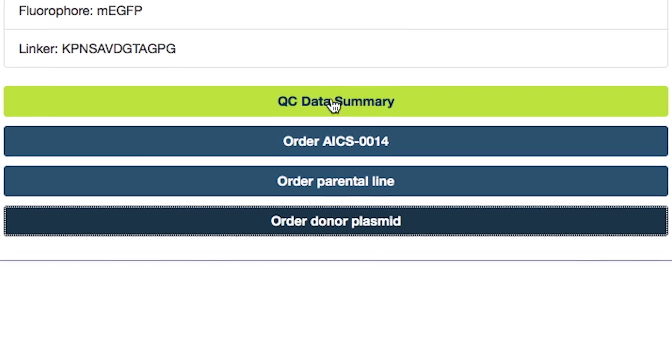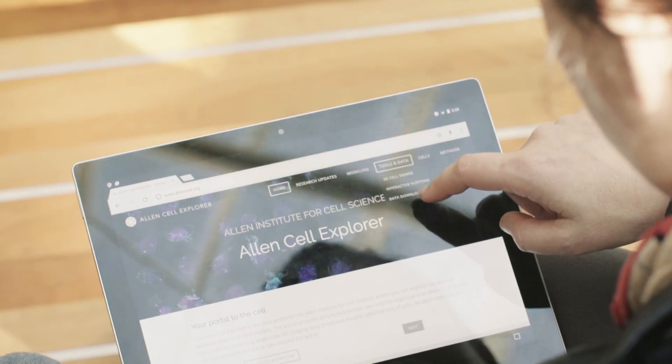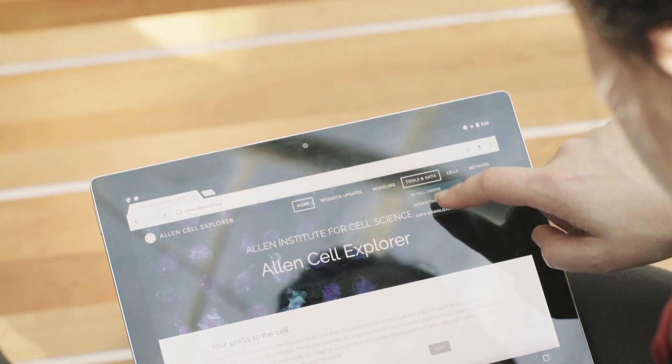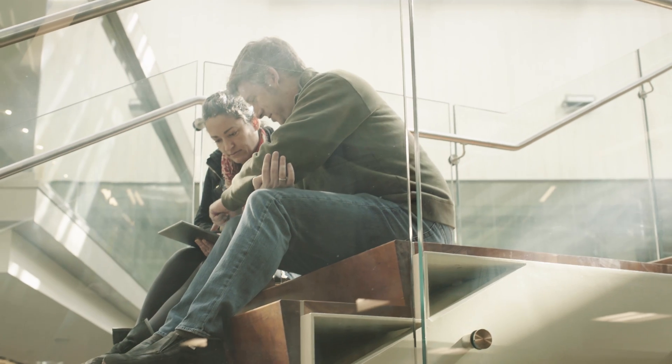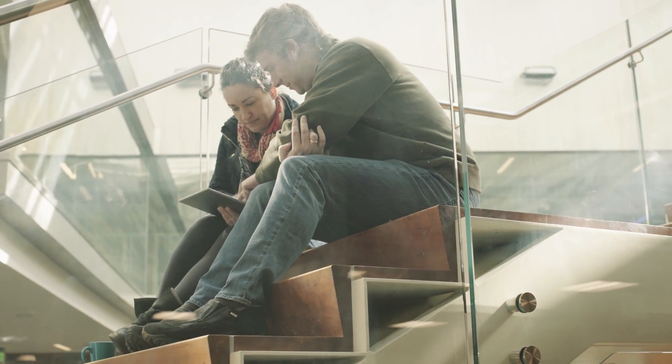The Allen Cell Explorer is special in that it has all of our image data. It also has the cell lines we've made, the plans that we've made, and tools, some of which are very new, that you can use to study cells.